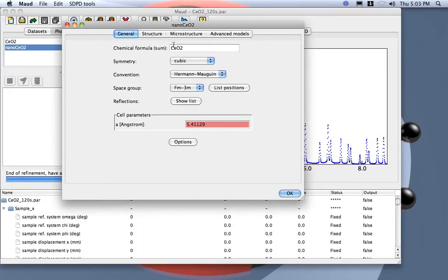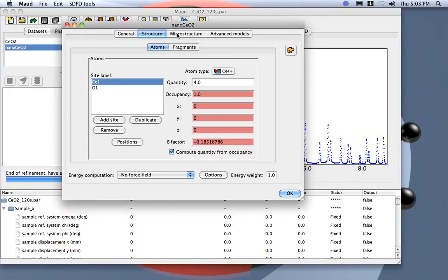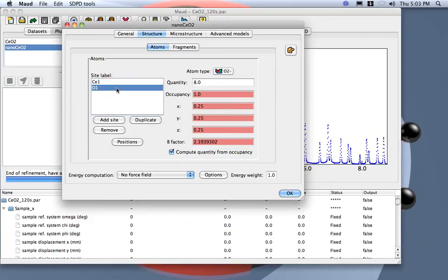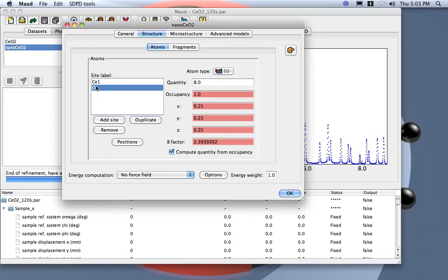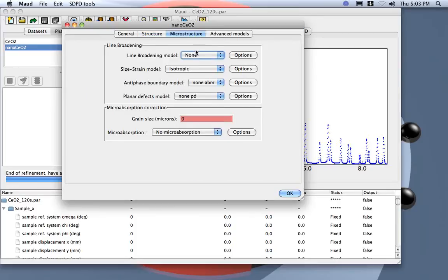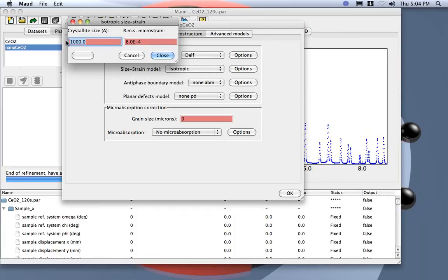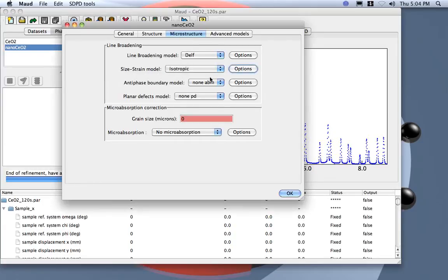Let's check the duplication — it should have the same as the other. What I need to modify: well, you see here we have a B factor negative for the cerium oxide, positive for the oxygen. This is probably due to the fact that we have to refine the occupancy of the oxide — we have some vacancy for the oxygen. Let's go to microstructure. For this one, we want to use a line-broadening model, so I use the Delf here and specify some small crystallites, something like 40, and let's start from a smaller value.